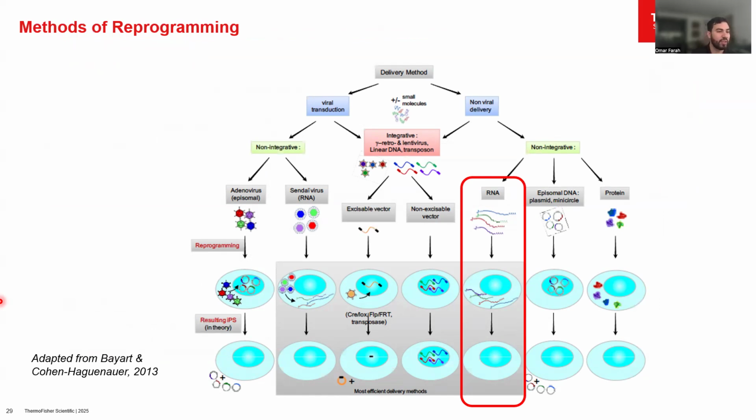And knowing the original starting cell number that we used for our transduction, you can get a relative idea of the reprogramming efficiency as well. So based on how many cells you use and how many colonies you end up with, given the assumption that every colony generates from a single cell, you could basically divide those two numbers by each other and get a reprogramming efficiency.